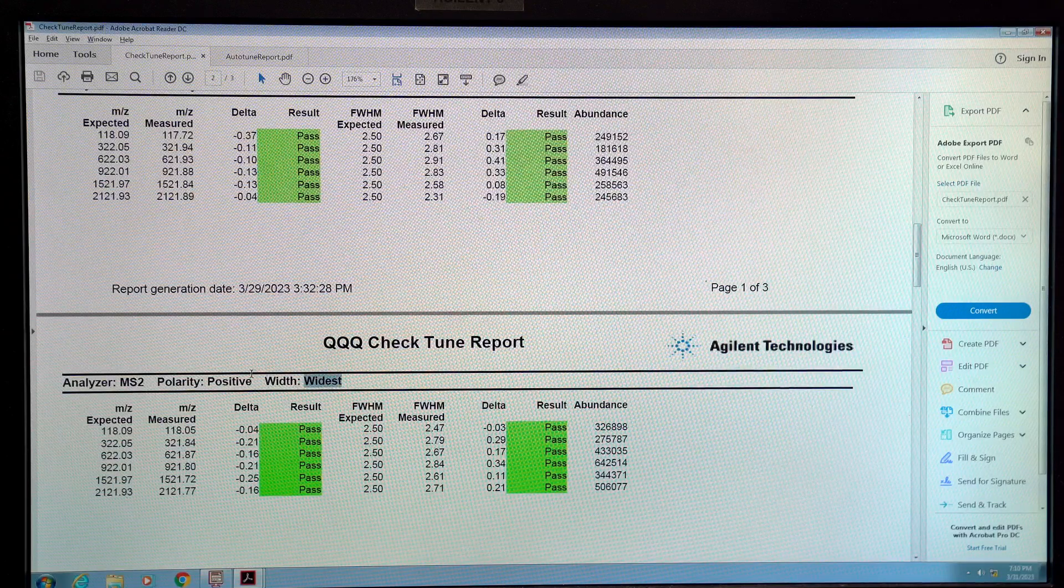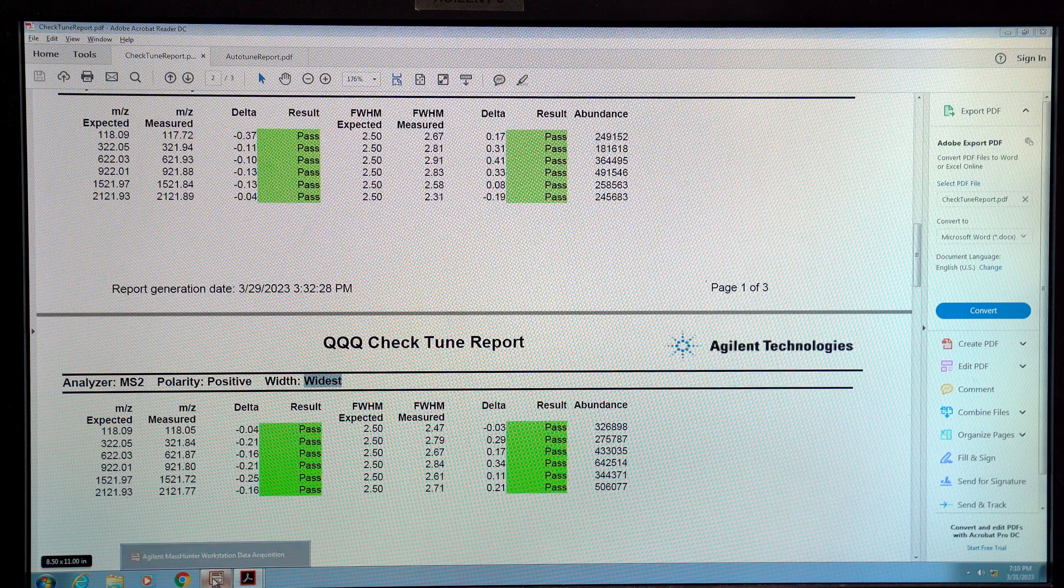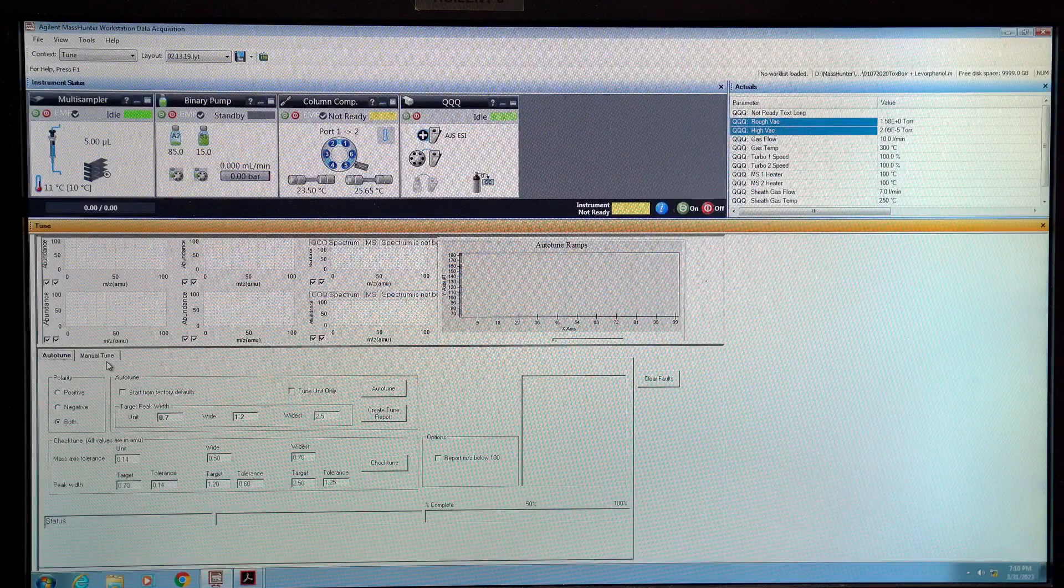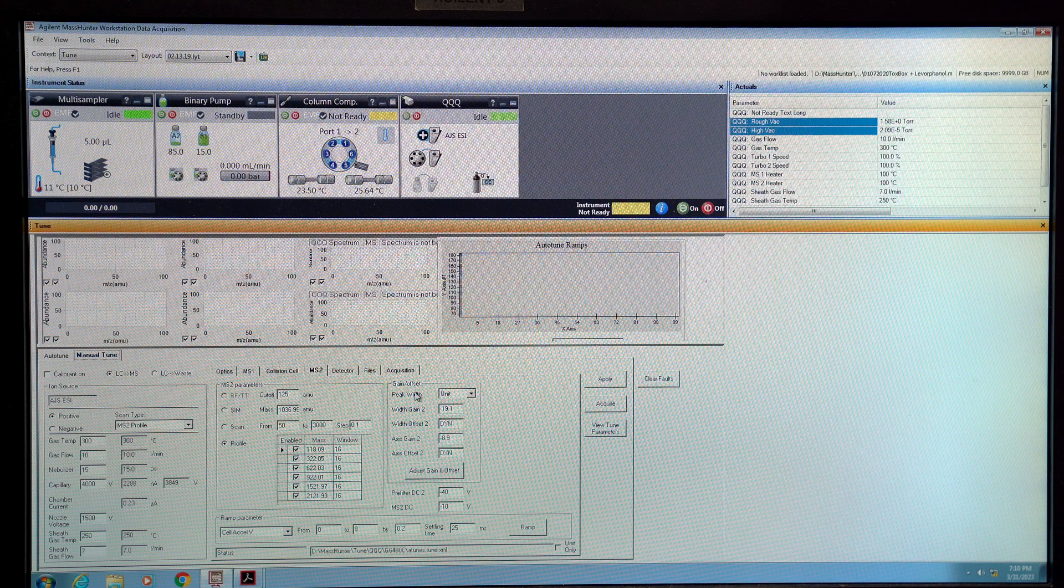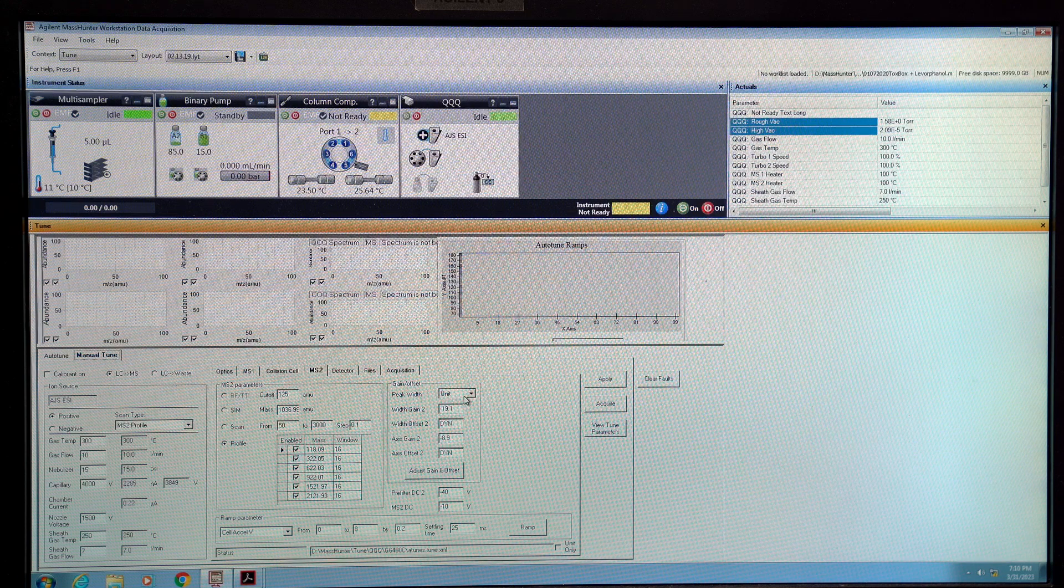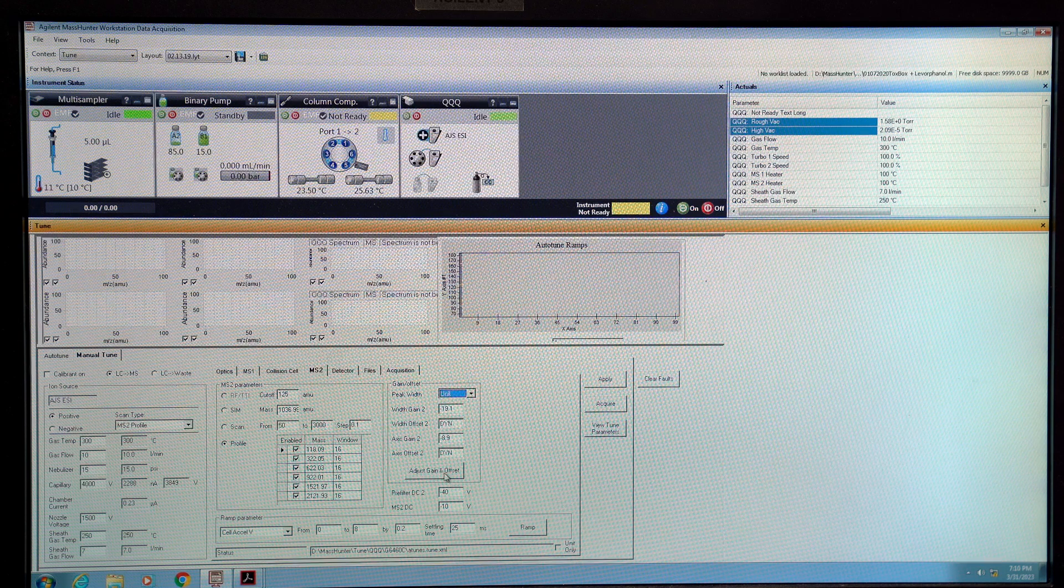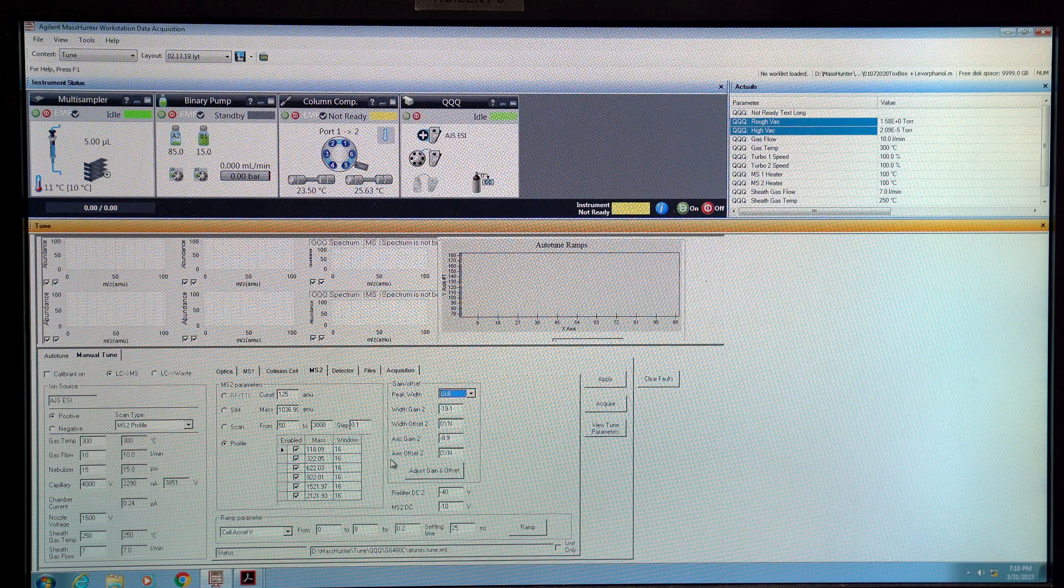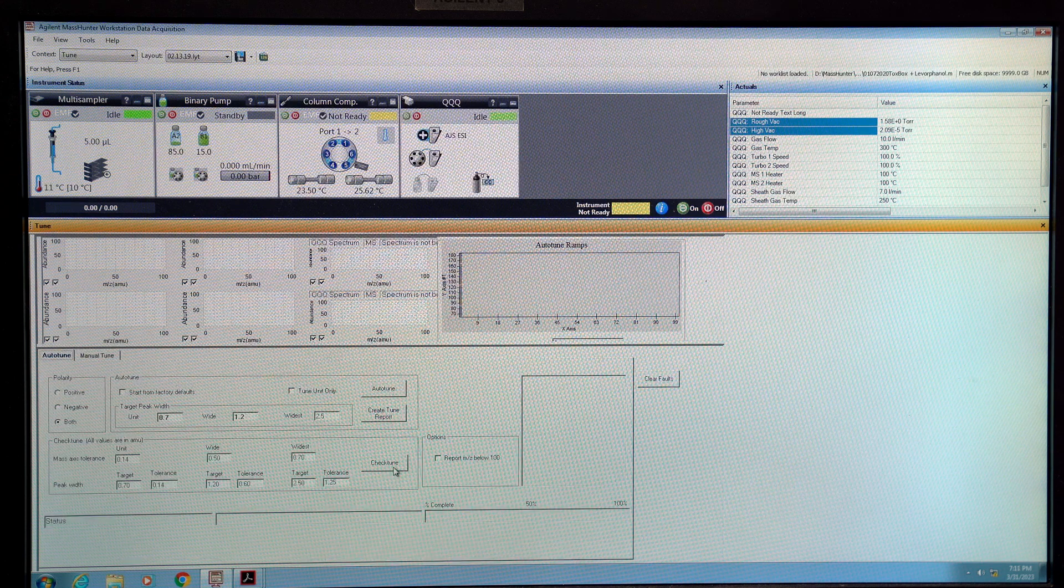If any one of these fails then you'll want to click on manual tune and then go on the gain over here and then select which one failed and then click adjust gain and then offset. Once you do that then you can go back to auto tune and check tune again.